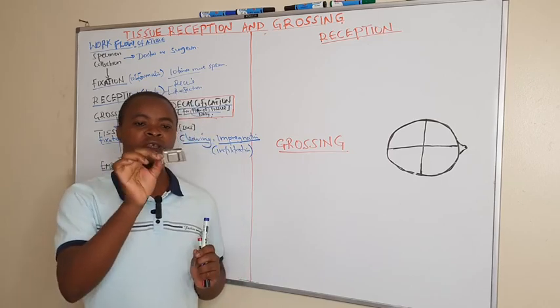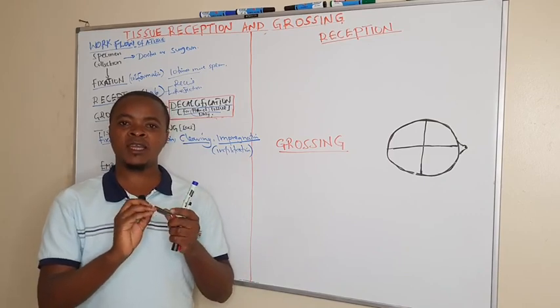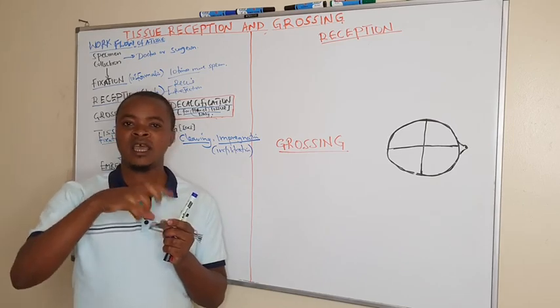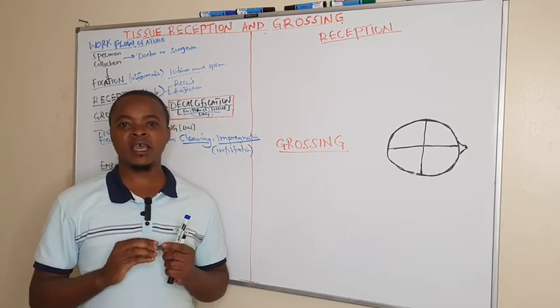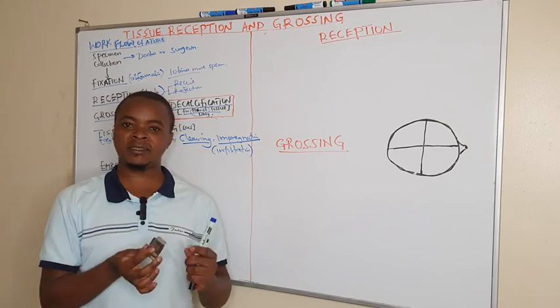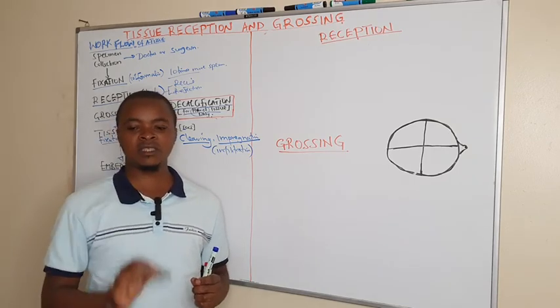This is the mold, and there are different sizes and types, whereby we add molten paraffin wax, then we orient the tissue in the mold, add more paraffin wax, and then we cool it so that it provides a medium for easy cutting. That is what we call tissue embedding using molds.